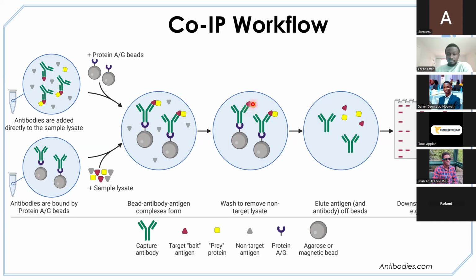So we have the complex here. Like I mentioned earlier on, we also use a buffer which has higher affinity for our protein of interest. And so we elute it from the beads so that it doesn't interfere with our gel or the Western blots that we perform over here.